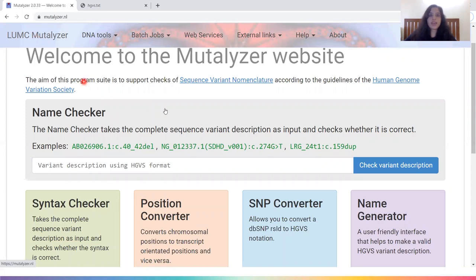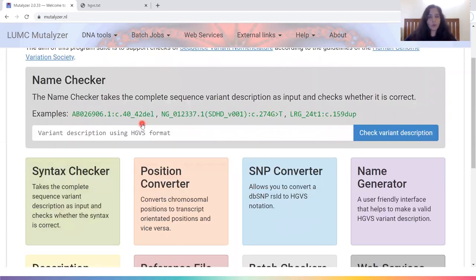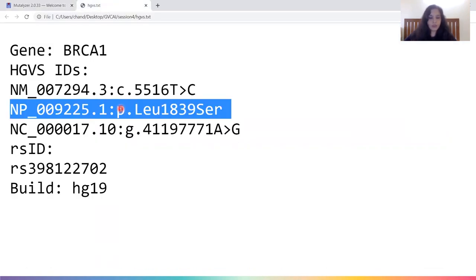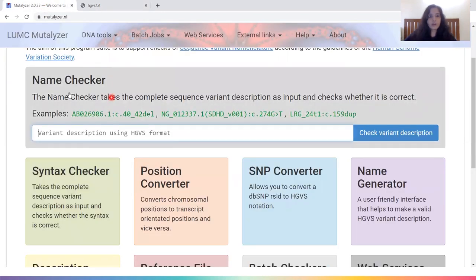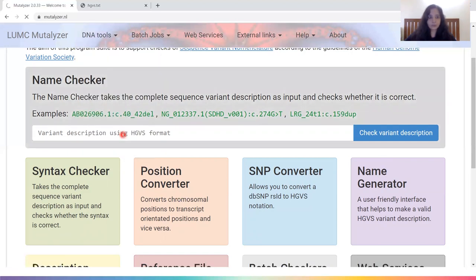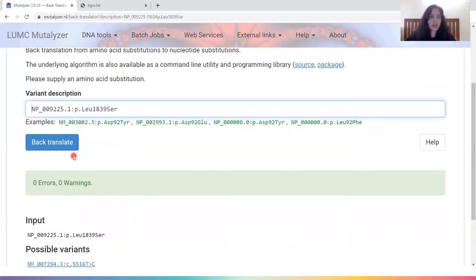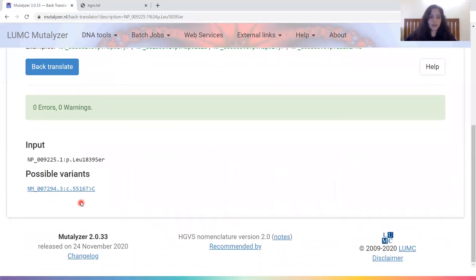What if the paper had only given us an NP ID or spoken only about the protein change? In that case, we would create an NP ID, paste it in the name checker to ensure the variant is correct, then go to the DNA tools dropdown and access the back translator tool. This tool back-translates our NP ID and generates an NM ID. This NM ID talks about a 5516 T to C conversion, which is exactly what the paper described — confirming it is correct.